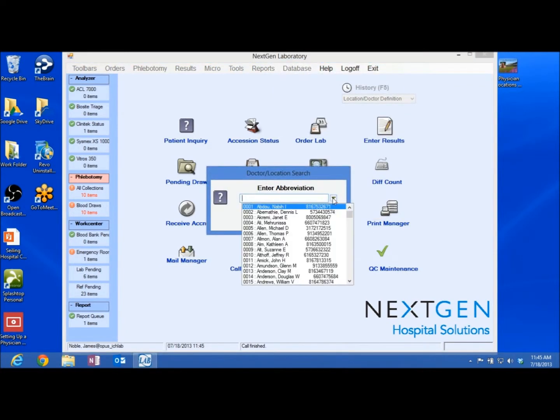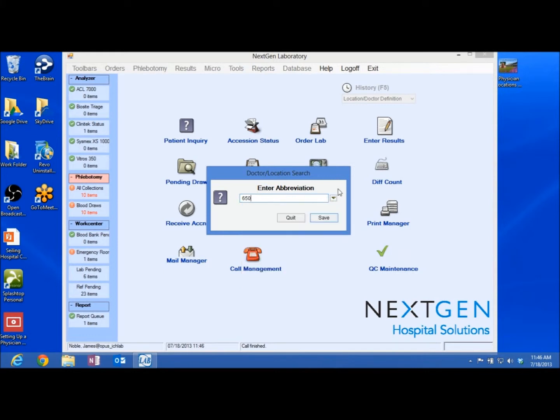Now, I'm going to click on this little drop down list, so when I'm typing in my number here, I can see whether we pull up any other name that's been assigned to that location. So here we go. I'm going to make this location 650, and as you can see, although there's a 650 here and a 650 here, what we're looking for is the location area, and neither one of these are in position 650, so I think we're okay to go right there. I think we're good, don't have to worry about that.